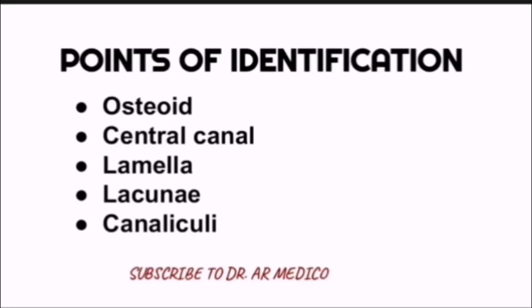Today we're going to learn about the points of identification for the bone slide. So if you get the slide of bone, you have to write these points of identification. Before moving ahead to the points, just have a look at the overall picture of the bone, how it will look.